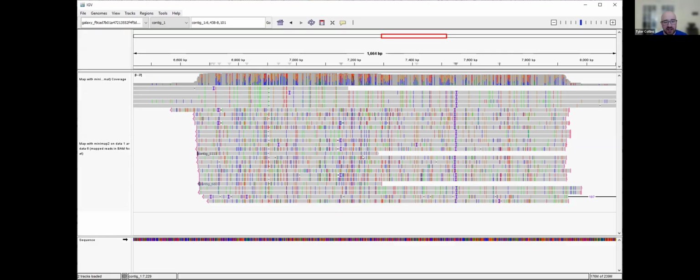If you look at some of these more individually, especially these top 4, they all have the same mutation pattern. Maybe these are all coming from the same species, and some of these are from closely related species with a couple changes. Oftentimes, the assembler is going to try and do a better job of sticking things together. It will favor that over other things. This would be something you might want to look at, especially with this contig.